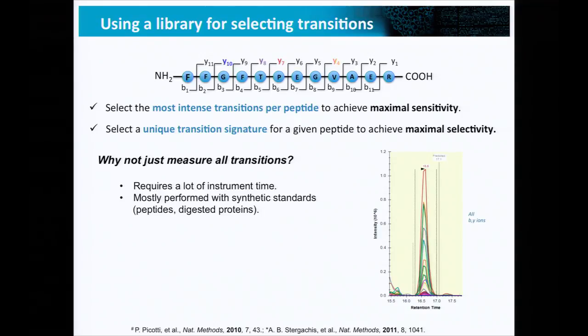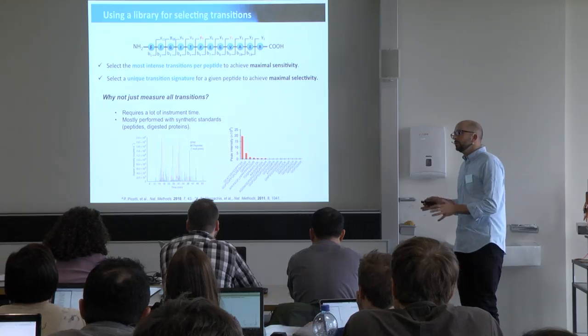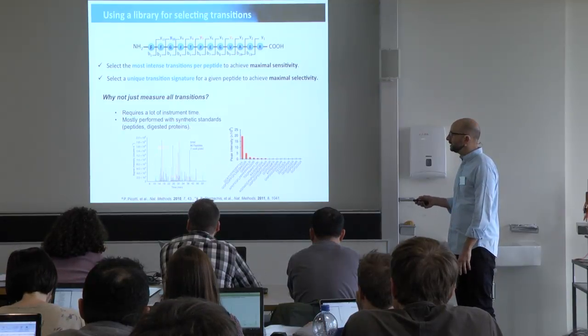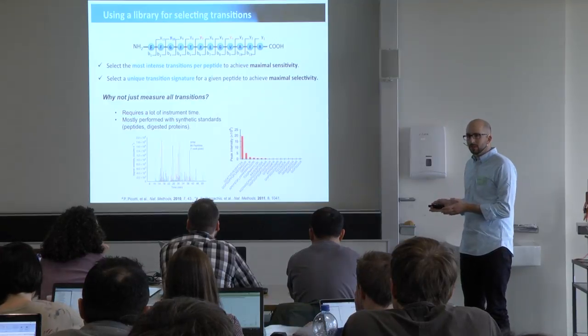So you don't always need to have a library, but the most common thing that we do is we do a library, and even when we work with synthetic standards, then sometimes we generate first a library out of them. And there have been several workflows in literature. One where you started with synthetic standards and then you generated on a Q-trap or on the same machine where you would do the measurements afterwards. You would generate using these synthetic peptides assays for peptides that you're interested in measuring.